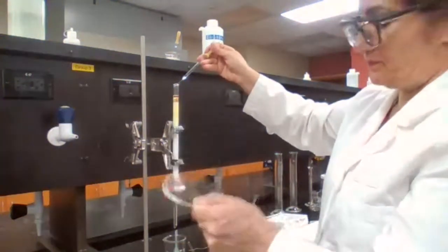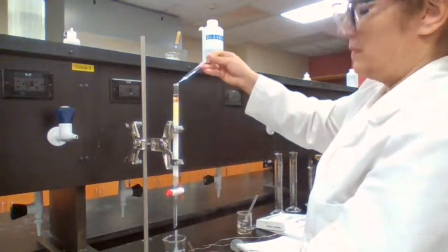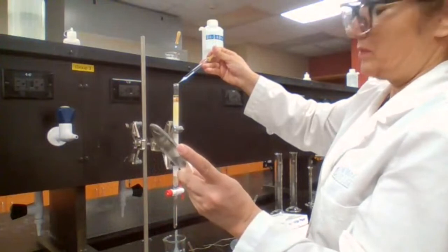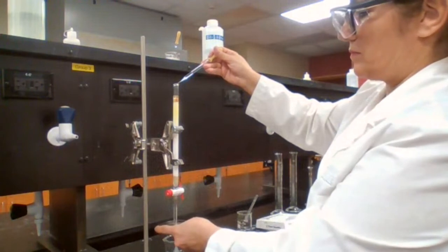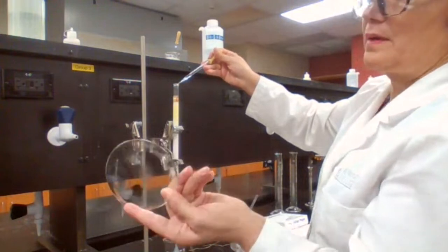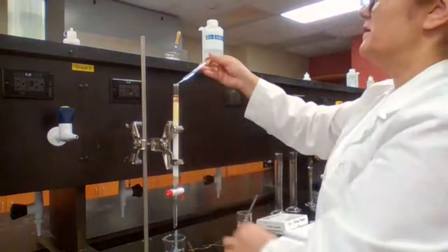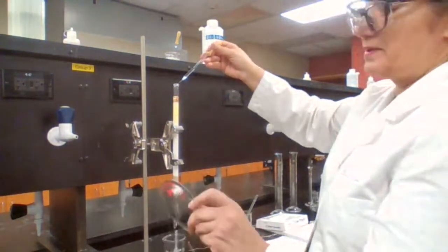Keep adding and testing. Testing, adding. If it's clear, I don't have to show you. As soon as I see the residue, then I will show you, because you already saw how it looks if it's clear. There's really no white residue, that's all. That means it's clear.